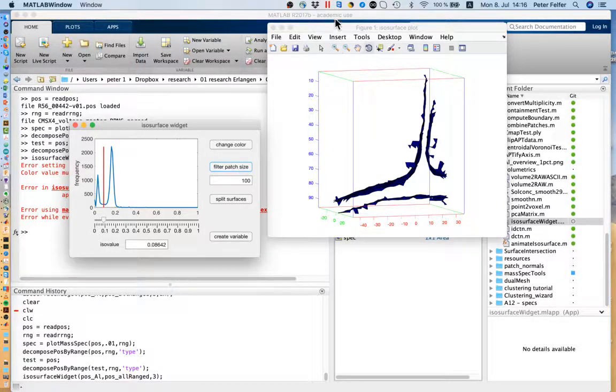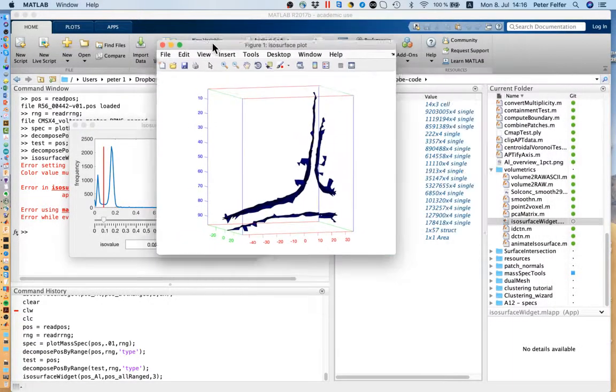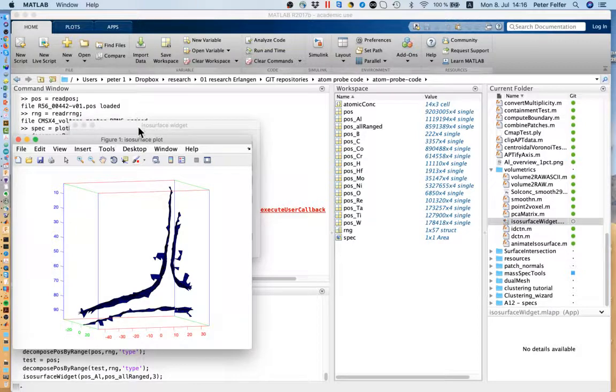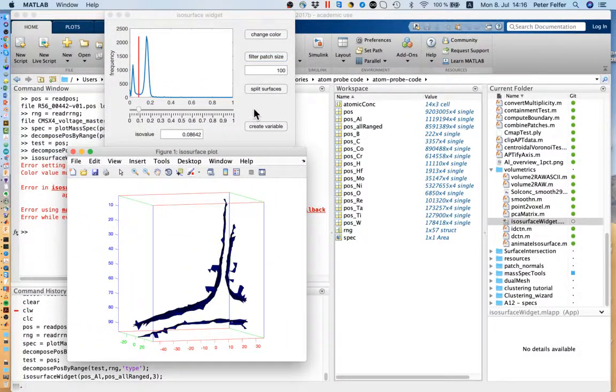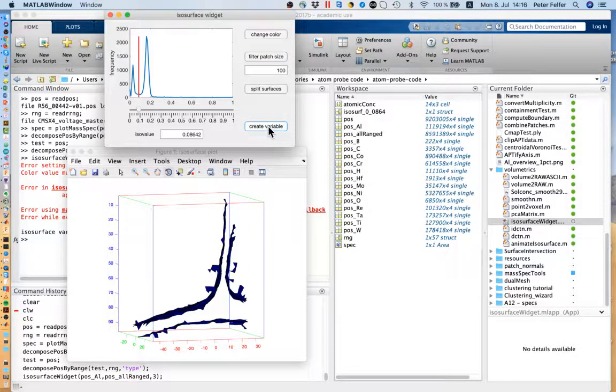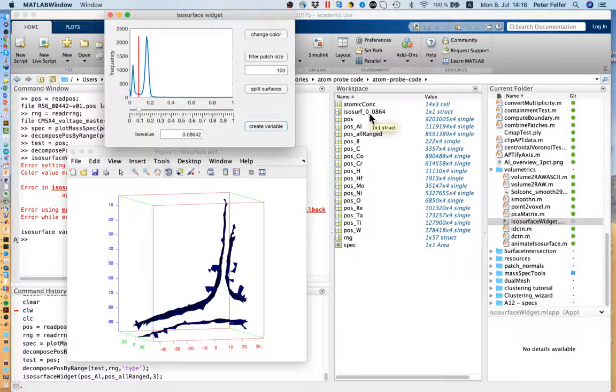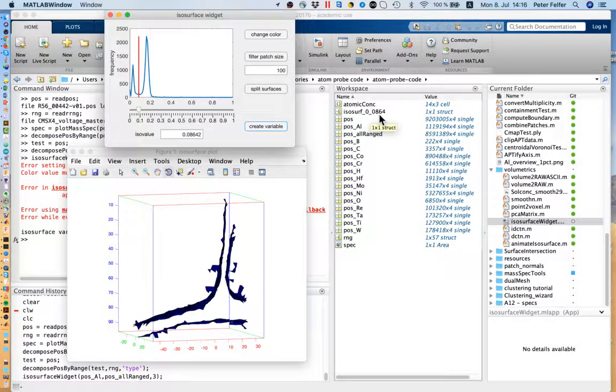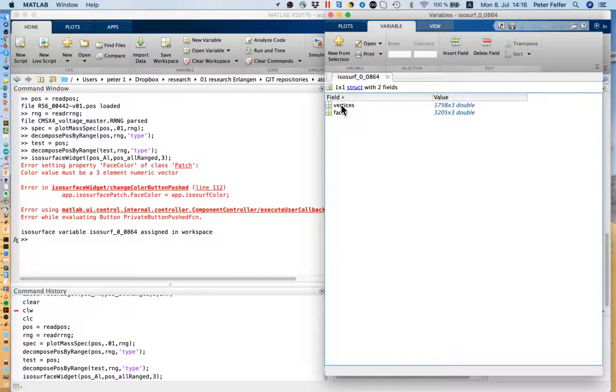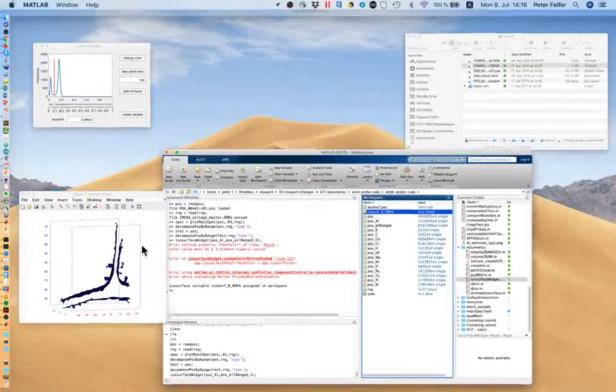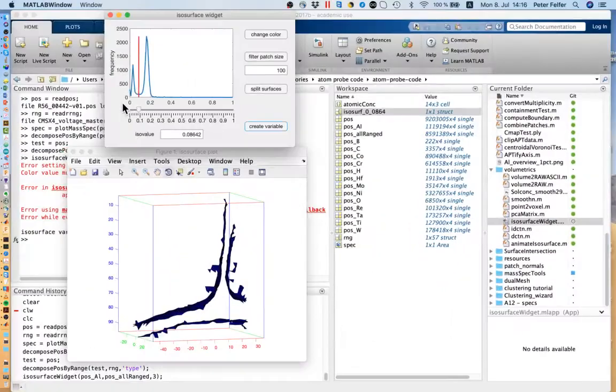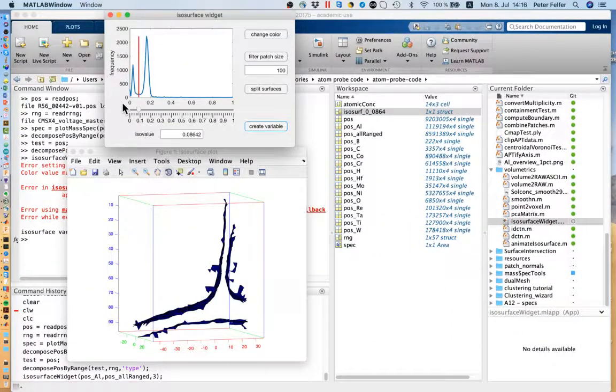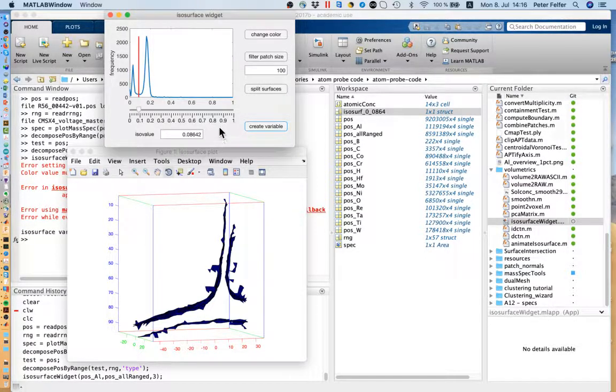If you're happy with the isosurface and you want to use it for analysis, you can press create variable. What that does is drop a variable called isosurf underscore zero zero eight six four, so 8.64%, as a struct. This struct contains the vertex and the face value, so no color information. That's why the coloring is not that important, it's just for you to properly see it in there. You can use that to do calculations of volumes or do proximity histograms and so on.